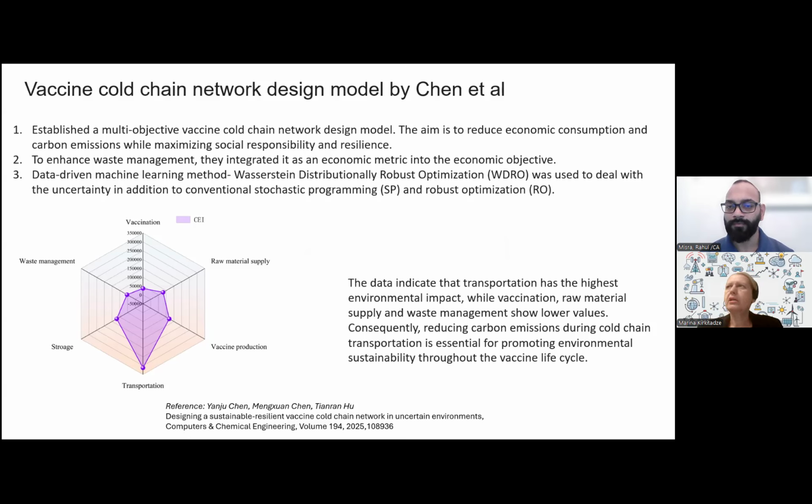I know we have only a few minutes left, but when you were talking about nano DSF, I want to highlight that the waste produced by that instrumentation is really small. These capillaries are tiny, and none of this goes into landfill because it's all for incineration. So from a sustainability perspective, it's really good.